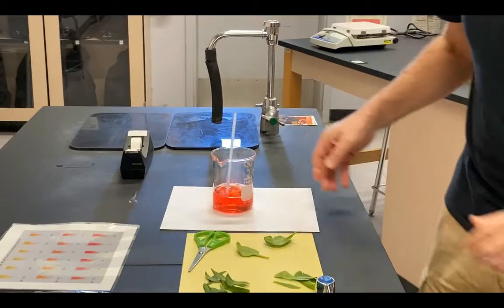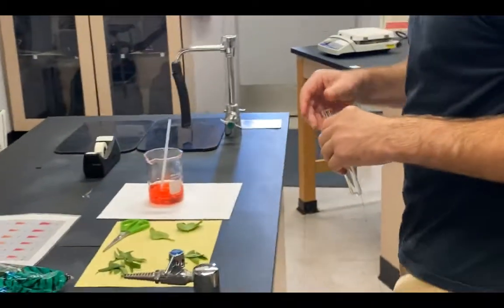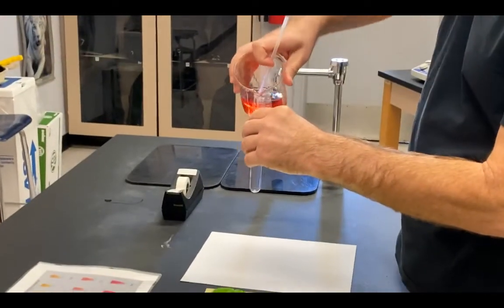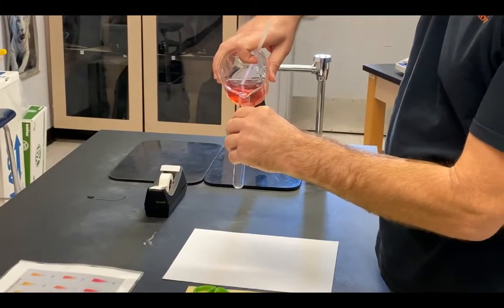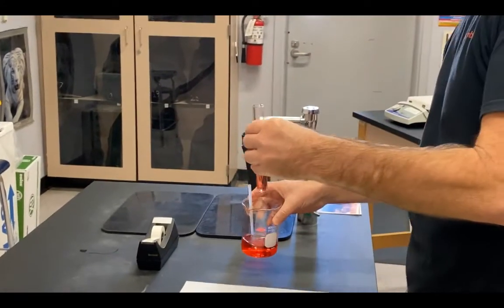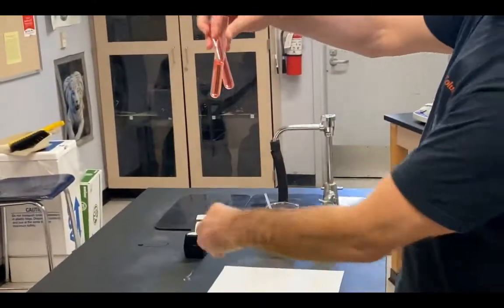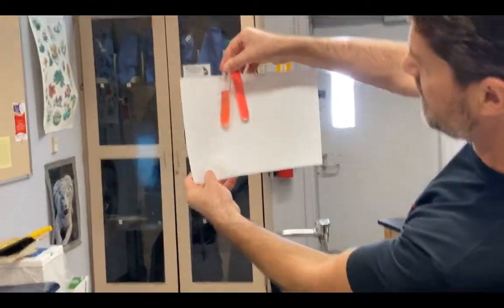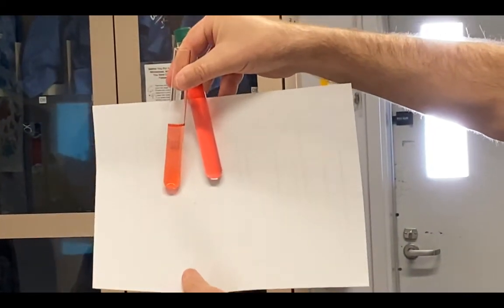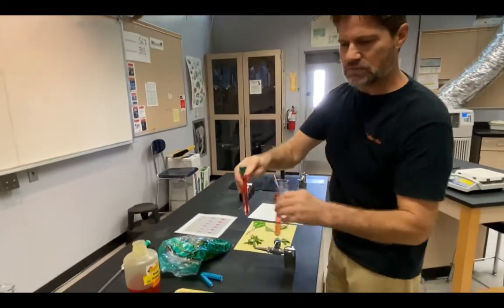And one thing I've learned over the years is that sometimes it's hard to detect the color change while this is in a beaker. So every once in a while, I like to pour a little bit out. And I like to take it next to my tube number 4 and hold it up to a white background. And I can see I already do have a little bit of a color change. I may produce a slight increase in that color change, but I'm already most of the way there.